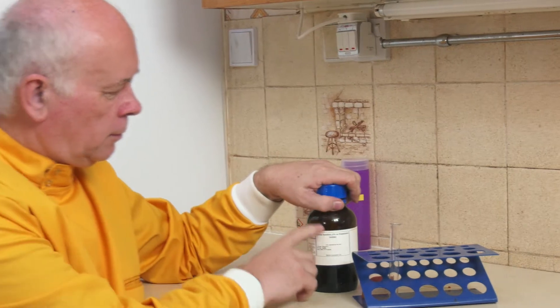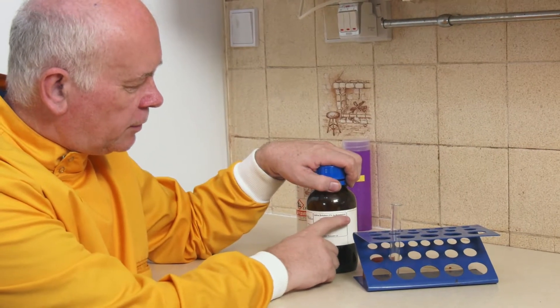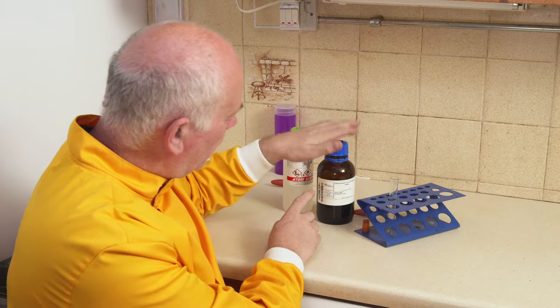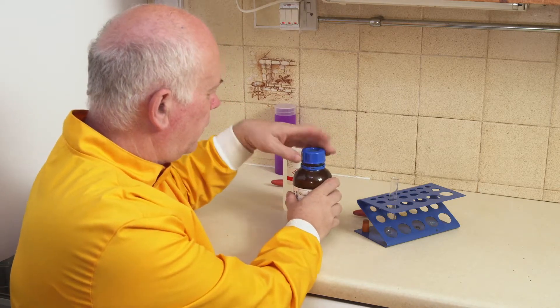In this experiment I want to have a look at dissolving iodine which is already dissolved in potassium iodide into cyclohexane. Oil floats on water so we're going to put the iodine solution in first.